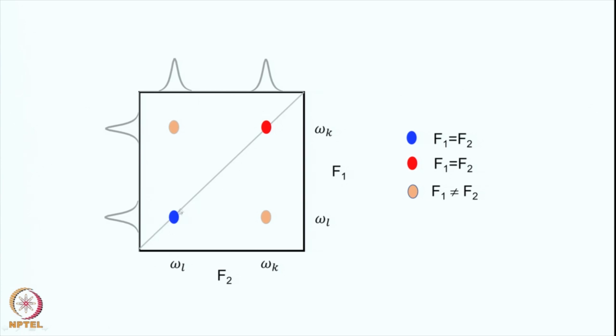If you notice, this is essentially a 1-dimensional spectrum. So the diagonal essentially represents a 1-dimensional spectrum. You take a projection here or here, it is the same frequency, right? Here or here it is the same frequency. But when you have lots of signals present, then you actually filter out those which are interacting. Therefore this was a major revolution, because you could display the interactions between the spins in a 2-dimensional plane, and that allowed resolution enhancement in the spectrum and extracting information which one could not do earlier.